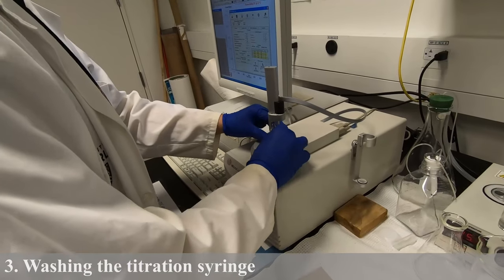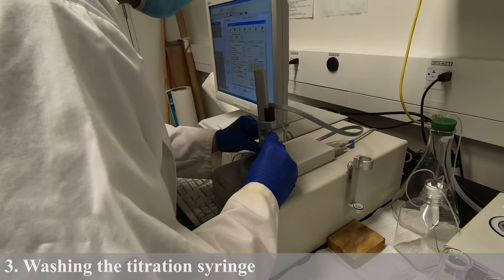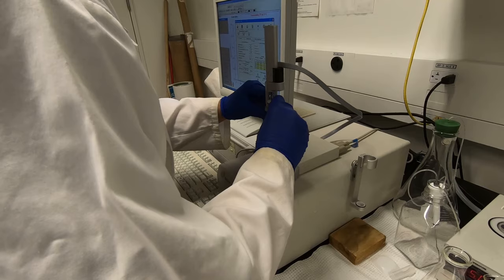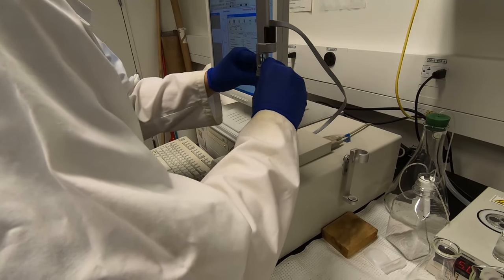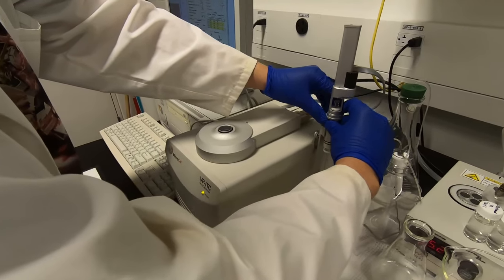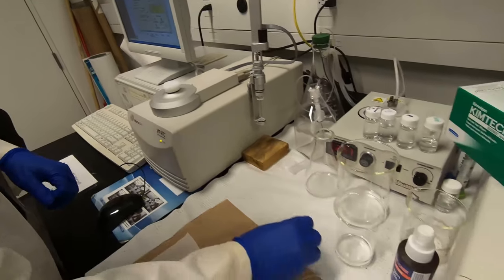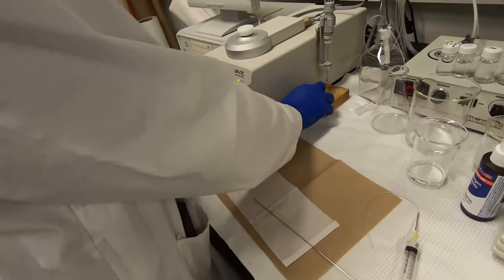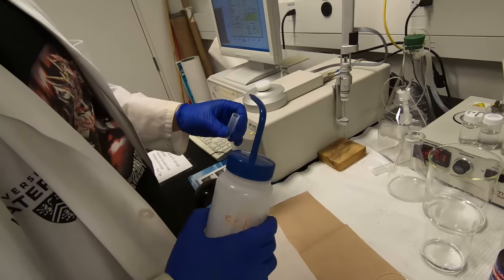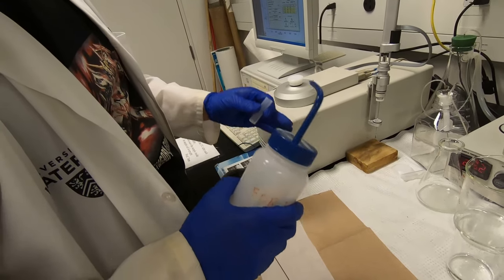Gently take out the syringe using both hands and slowly move it out. Then put it down here. The way you clean the syringe is the same way you fill the syringe. Usually we clean it with surfactant solution and then with water.